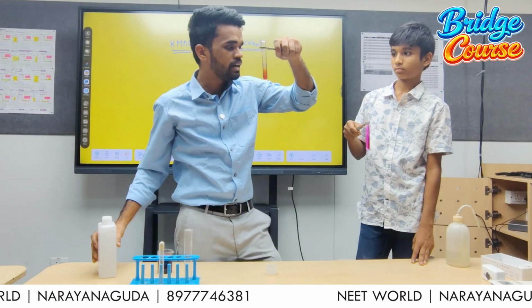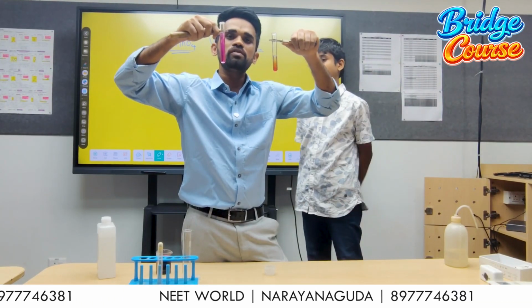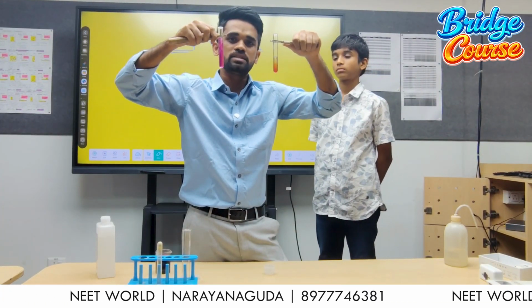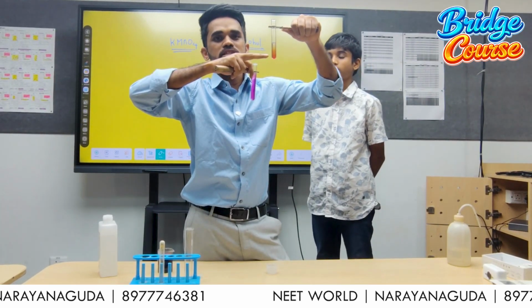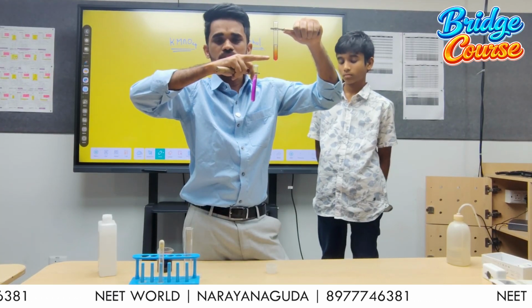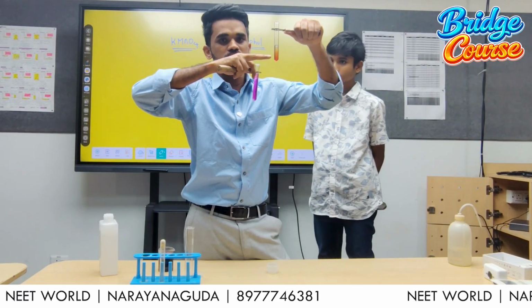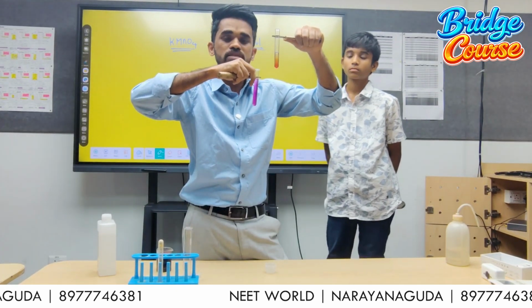Yeah, you can see here what makes the difference in both of these. See here, the KMnO₄ pink color appears as it is, but here the KMnO₄ color is completely changed to brown color or almost colorless, right? Upon addition of a little more acid to this, complete decoloration takes place. So now what is happening in both cases?